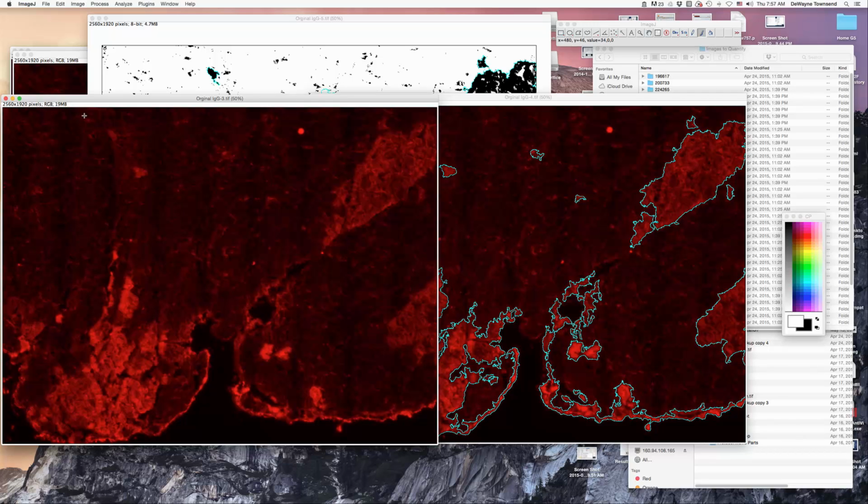You see I go back and forth between the labeled image and the unlabeled image, trying to assess where the injury is and where it's not. One area that's particularly troublesome is down here, right along the edge. You'll often get a very positive, brightly staining immunoglobulin area right along the endocardial or epicardial surface.